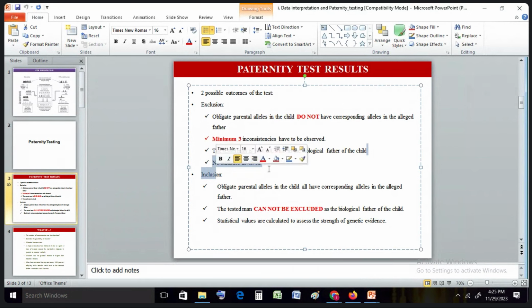এটা তুমি বলতে পারবা. And as it is exclusion, as previously discussed, you don't need any statistical analysis involved. No statistics is required there. But if you have an inclusive result, like দুইটা mismatch পাইছো, বাকি all other match, so it is inclusive.